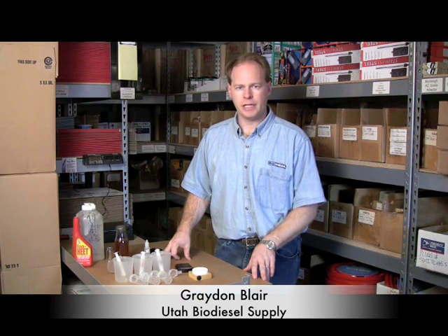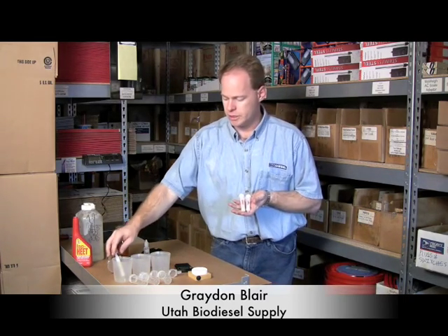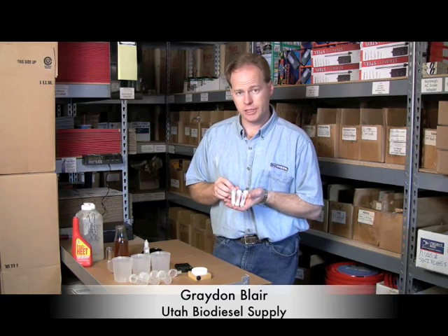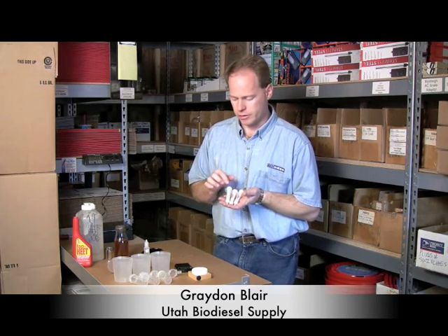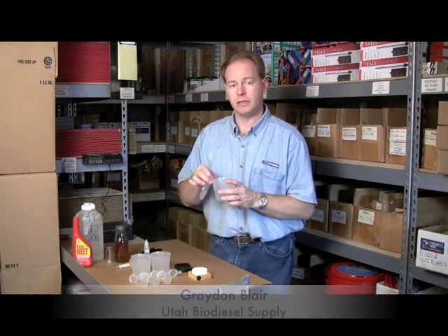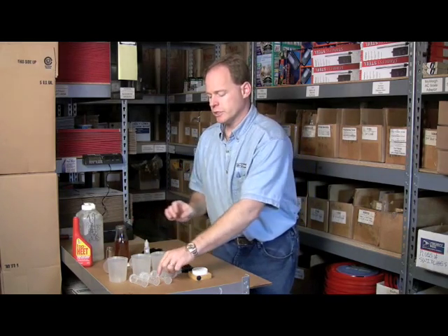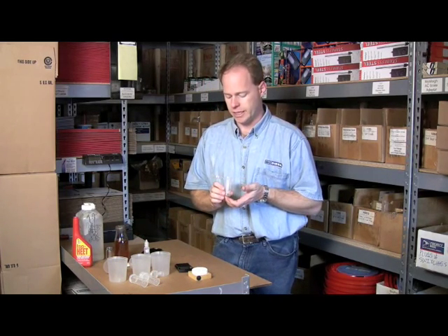Today we're going to do a basic titration using our mini titration kit. This kit comes with three color-coded syringes for oil, alcohol, and titration solution — they're labeled and color-coded. It also comes with three cups for the fluid you'll be titrating with, and six vials which are what we use to do the actual titration.